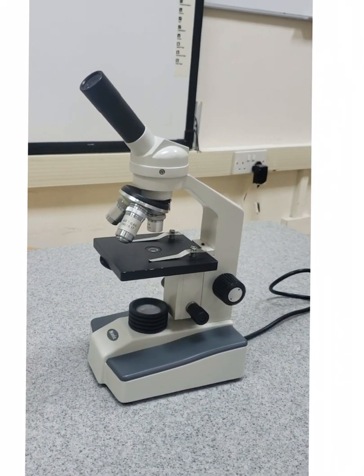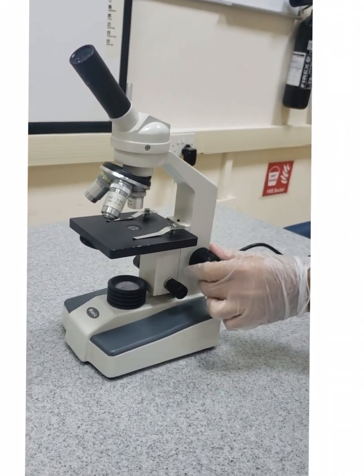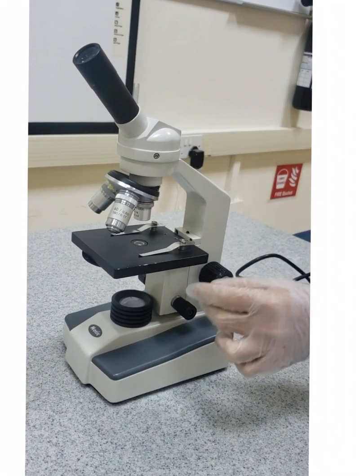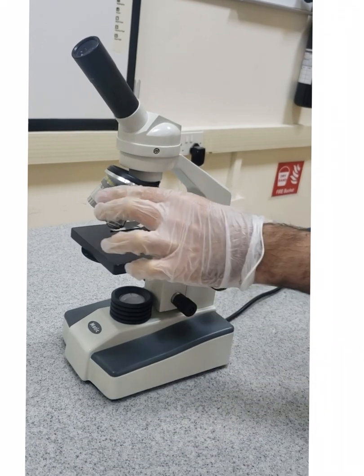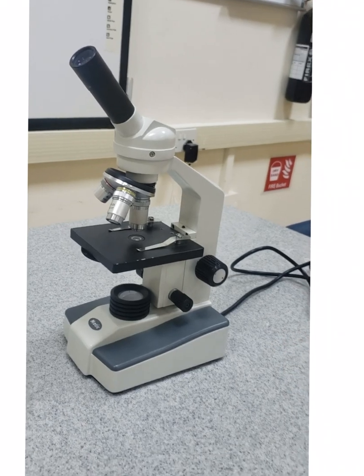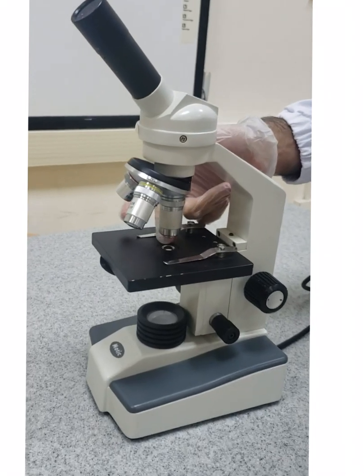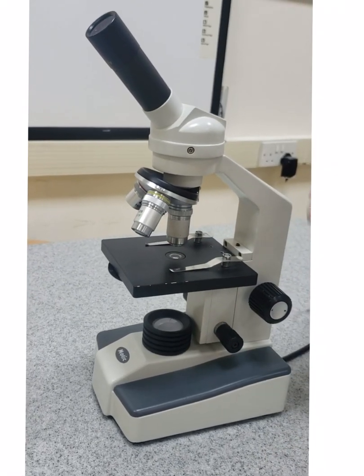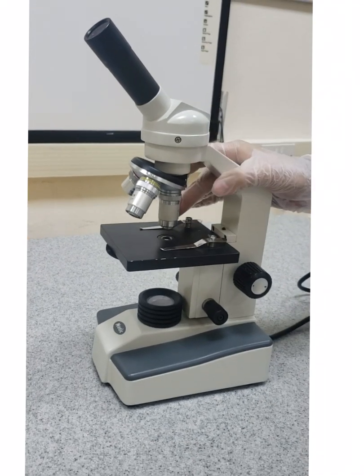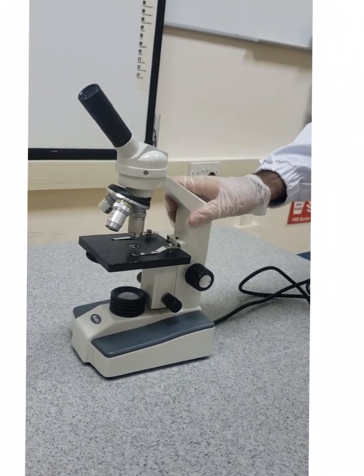The third thing, don't forget guys, use the coarse adjustment with the least powered objective and use the fine one with the highest objective. Don't switch them. And the last thing that you should know, don't clean or try to clean the lenses with your hand or with the gloves or with a normal tissue. The lenses are cleaned with lens paper only. Okay, now we can use the microscope.